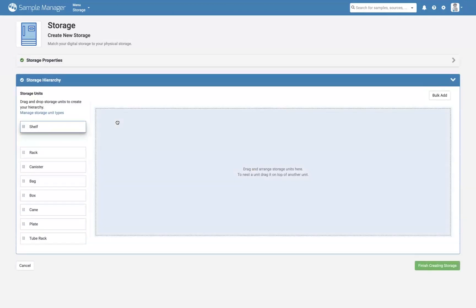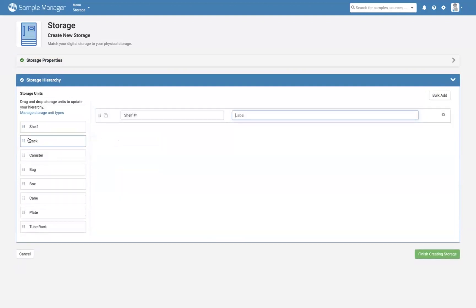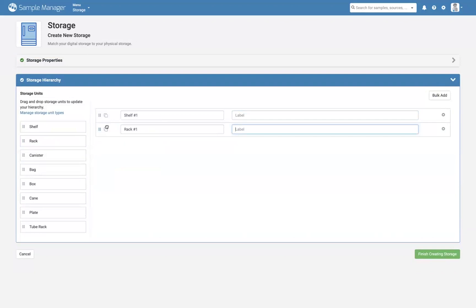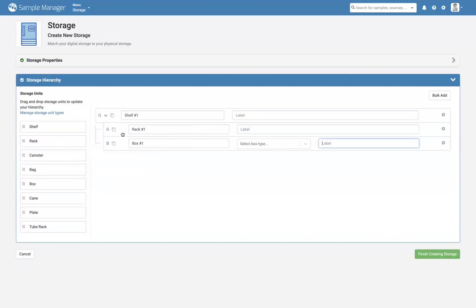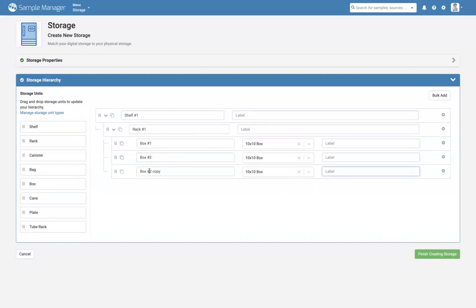To create the storage hierarchy, drag the necessary unit types to the drop location. Move them around or update the unit names to match what's in your freezer. Use the Copy icon to quickly make new storage units, or delete units that aren't correct.